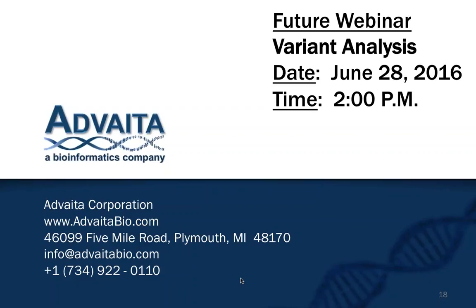Gotcha. All right, very good. We had another question: do the overlaps in the Venn diagram, at the gene level, only include proteins and genes in which the change is in the same direction, or also those significant genes where the change may be opposite, so the gene is up and the protein is down? That's a really good question, and you worded it better than I explained the answer during the webinar. It only includes the common genes and proteins, not necessarily the same direction.